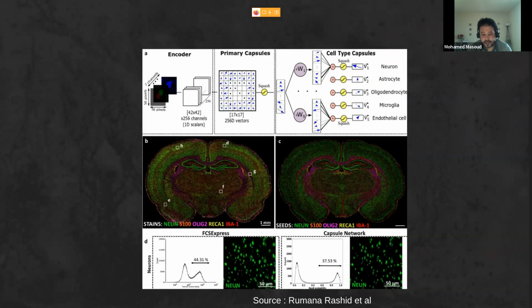So as we can see from the last row, this is showing the difference between the thresholds and the capsule network. The graph here for the threshold part shows you there is an overlap in the intensity.